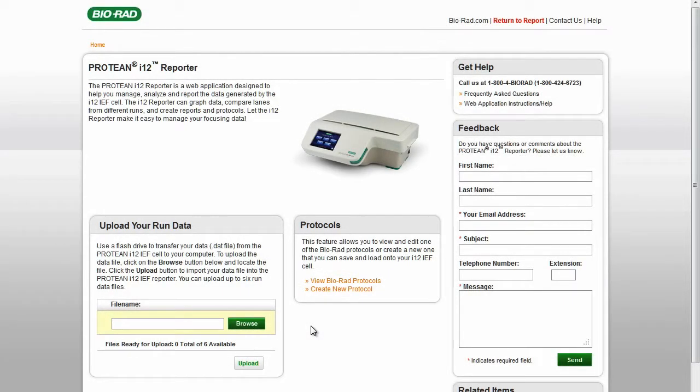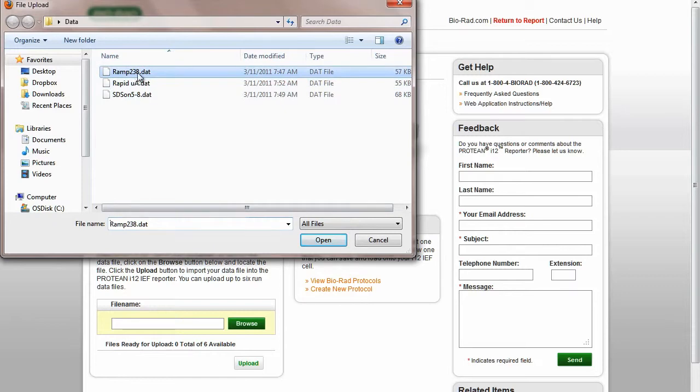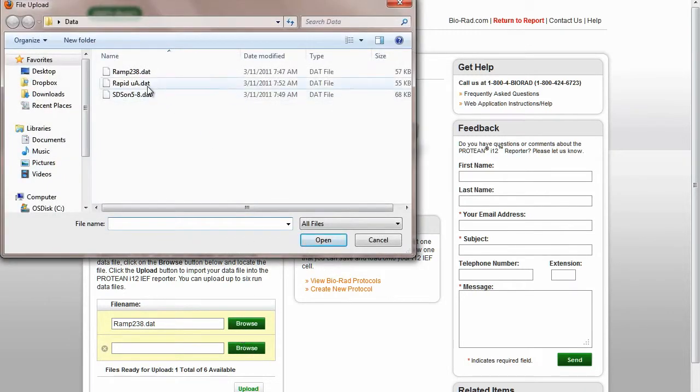On the PROTEAN i12 Reporter homepage, under Upload Your Run Data, click Browse and navigate to the run data files you would like to import, then click Open. Repeat the process for all the files you would like to upload.